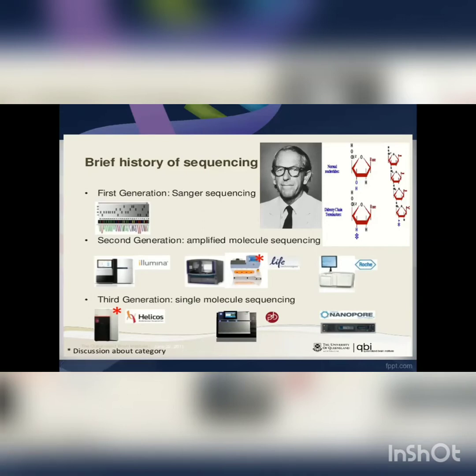To do this, firstly, the input sample must be cleaved into shorter segments, and the length of each segment will depend on the particular sequencing machinery that's used. The fragments are ligated onto generic adapters and annealed to the slide using the adapters. PCR is then carried out to amplify each read. Then they are separated into single strands and then sequenced.